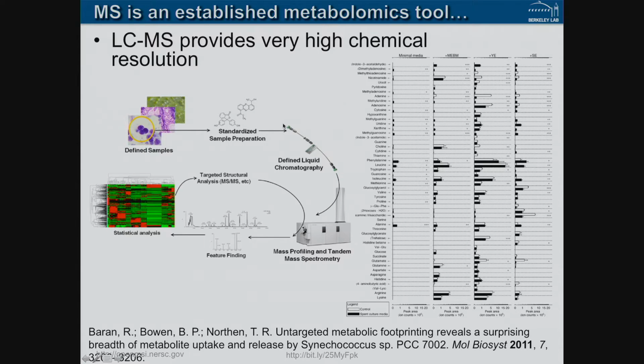Instead, what would be your spatial dimension is now time. So you're recording spectra as a function of time. You record a lot. In time, the molecules are being separated by a combination of solvents and a stationary phase. So you have the solvent composition flowing over a column, and it's pulling molecules off by their physiochemical properties.